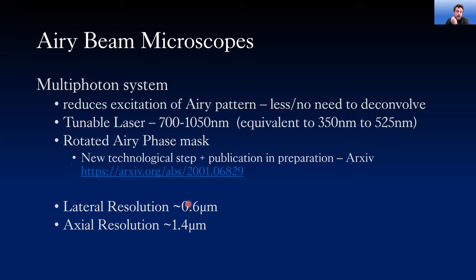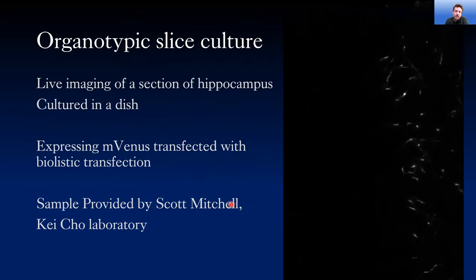The resolution within the focal plane of what you're looking at is the same as before, but there's a slight cost to the axial resolution. No need to post-process the data. And some imaging that I did with Scott and Kay last year, which is going into that publication, is with some slice culture imaging.